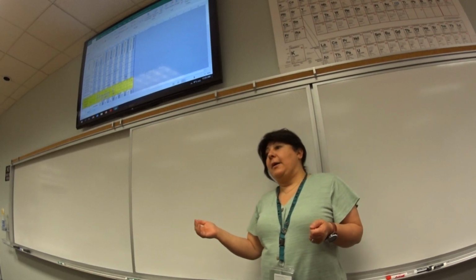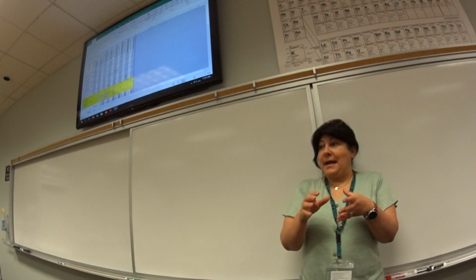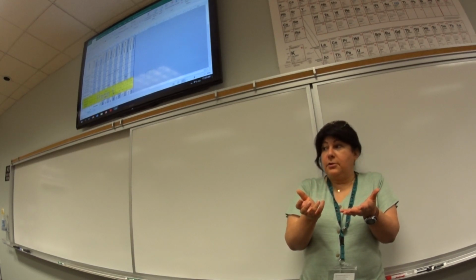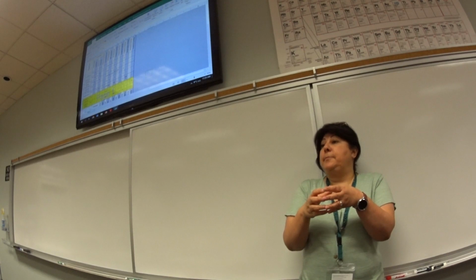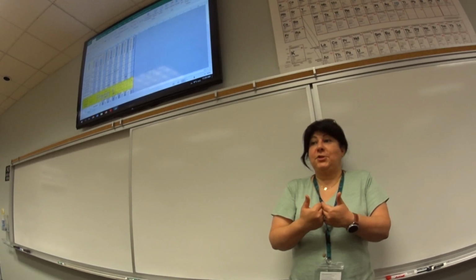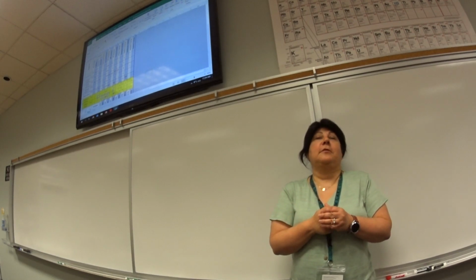So if you come back on Monday, you will have your plate with tons of bacteria on it, and you will have single isolated colonies that you could go to, or if you see basically everything looks the same in all the other areas. I will keep it in the refrigerator for you so it stays fresh, so your results would look good for your biochemical assays.